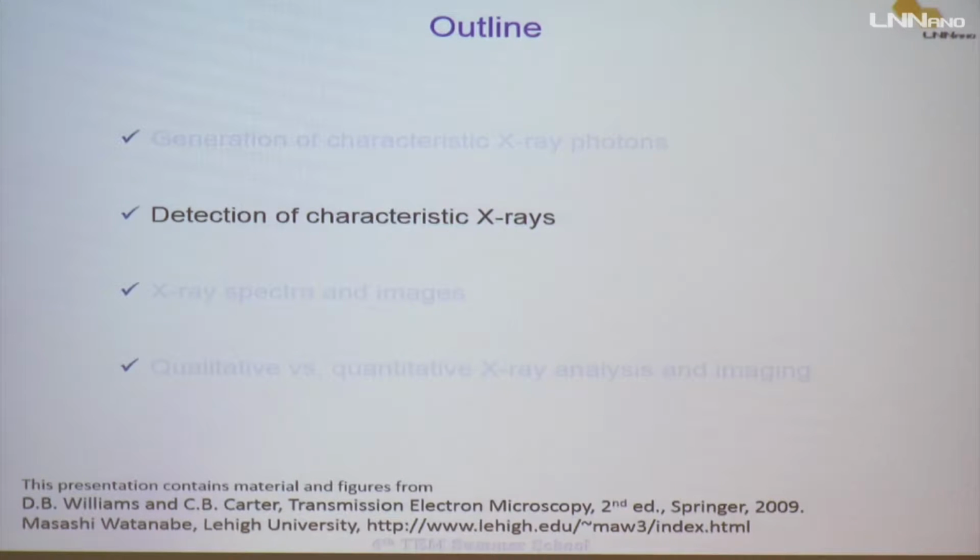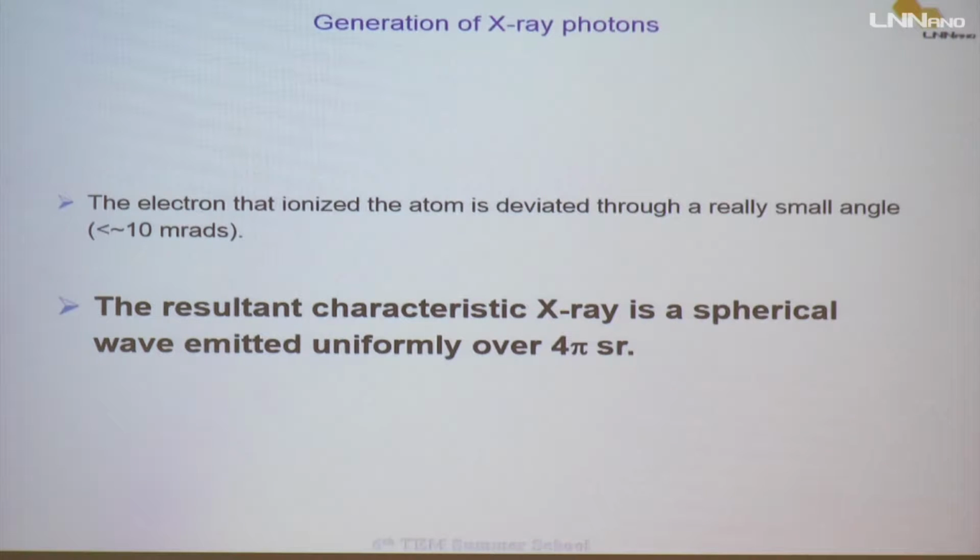Then we have the detection of these characteristics. We have in our mind now that there is a probability for the generation of the X-ray photon, a probability of your element decaying following different steps, and you also measure differences in energy.